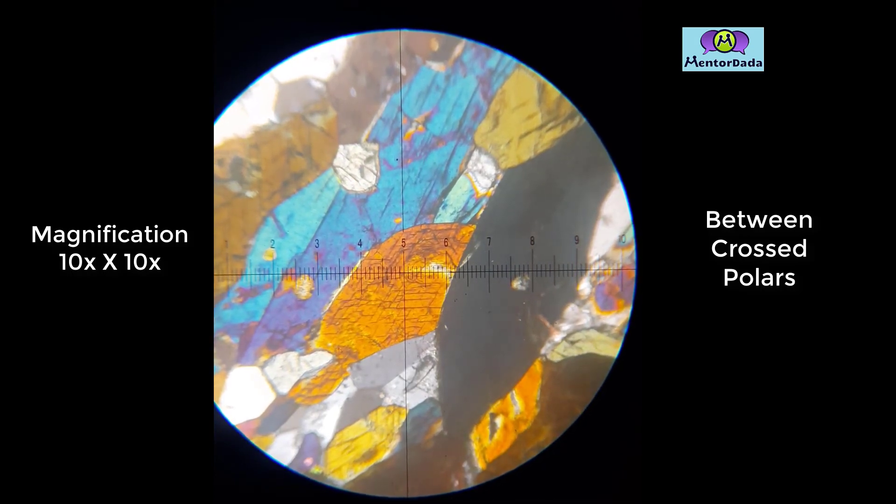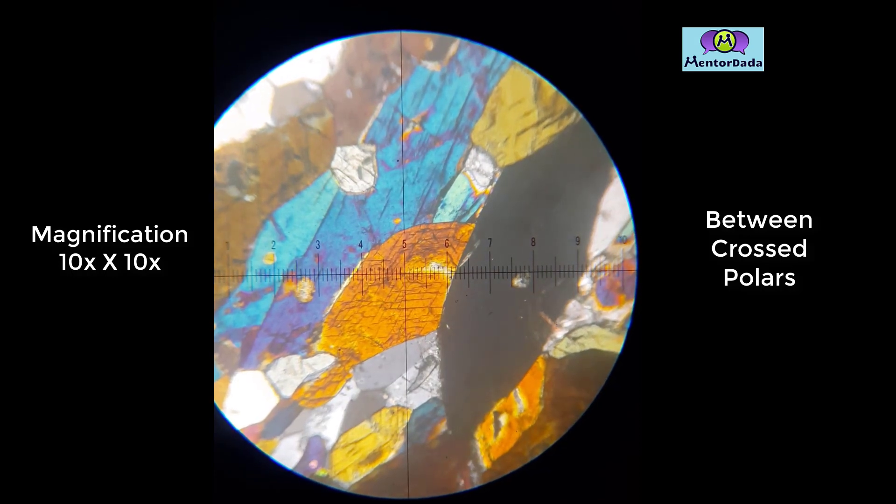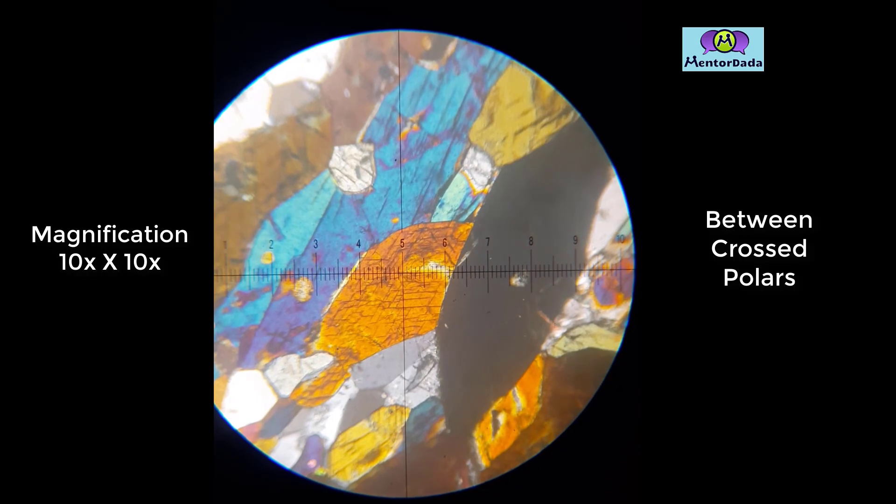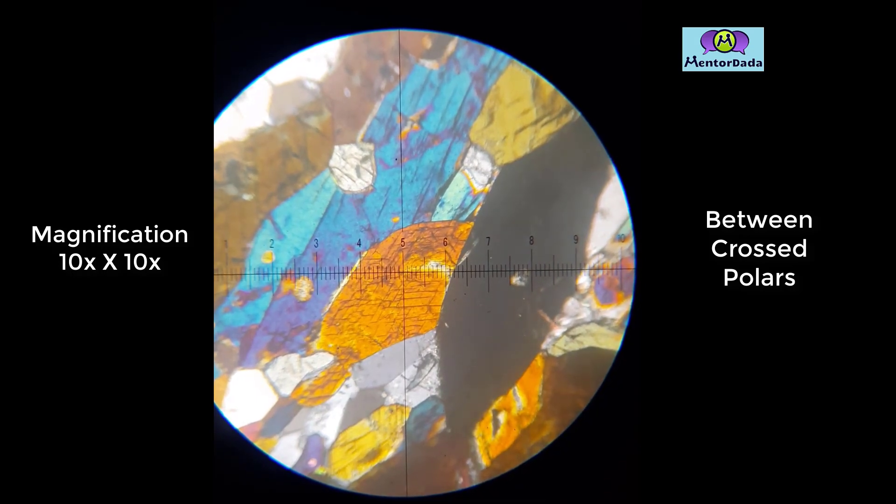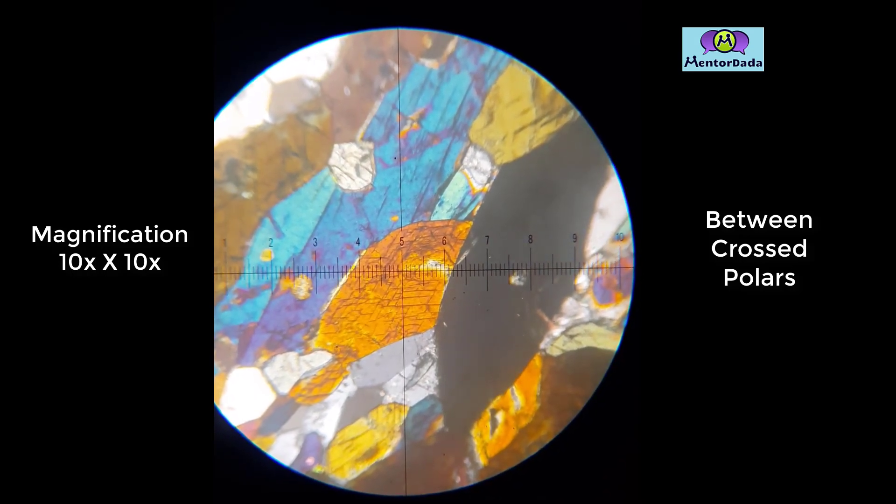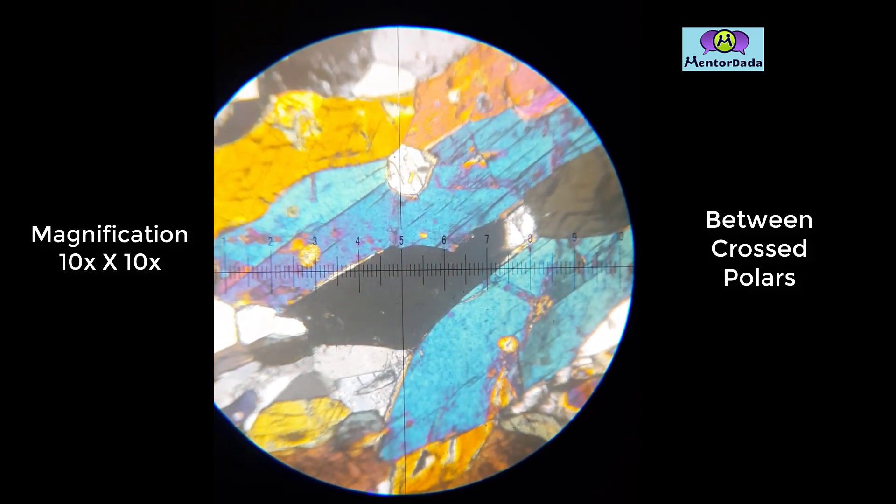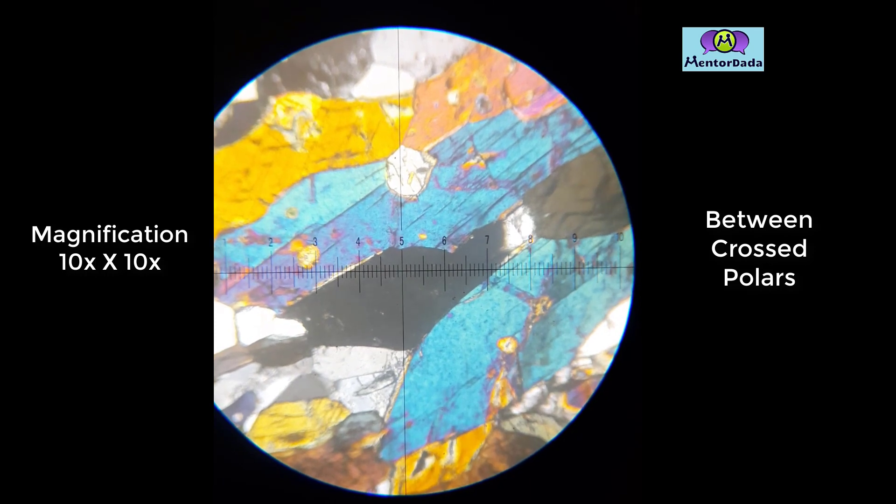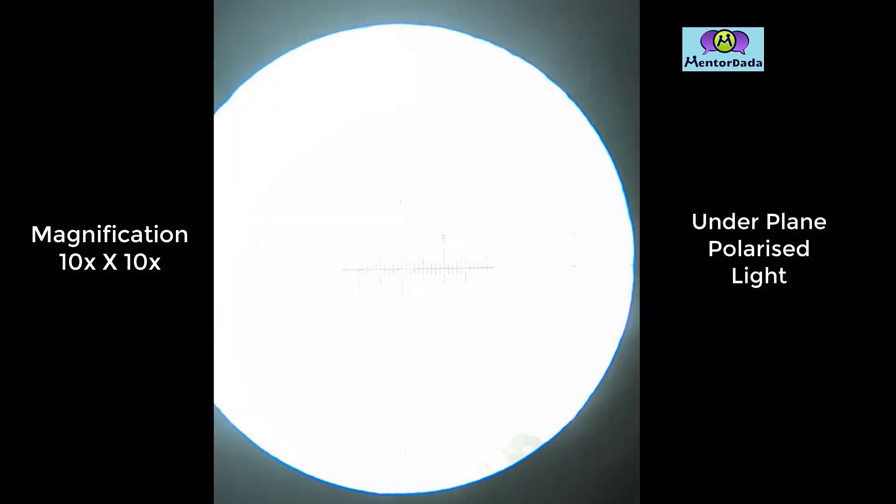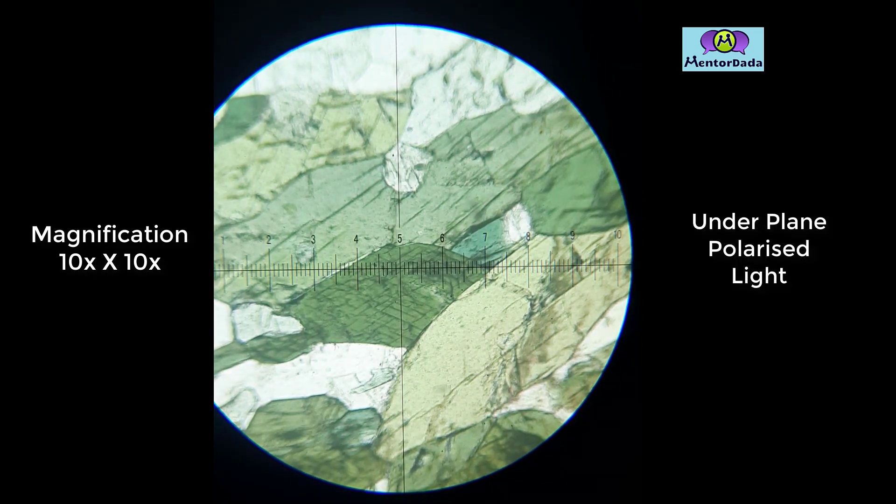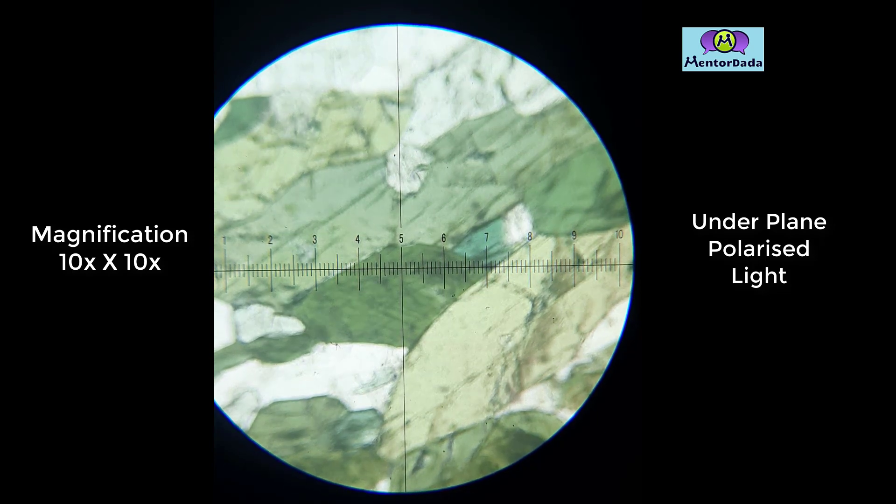As we are rotating the stage, the mineral is getting extinct. At this situation, the cleavage planes are making an angle with the polarizer direction.